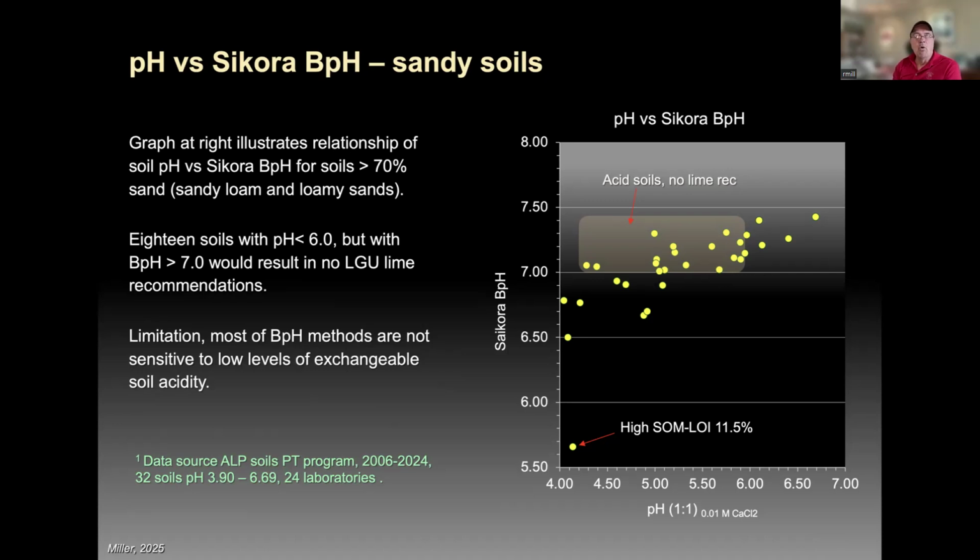So my point here is the limitations. Most of these buffer pH methods really do not do a very good job on low CEC soils, soils dominated by sand, and specifically soils with very low organic matter.